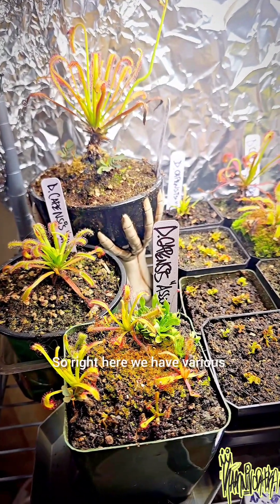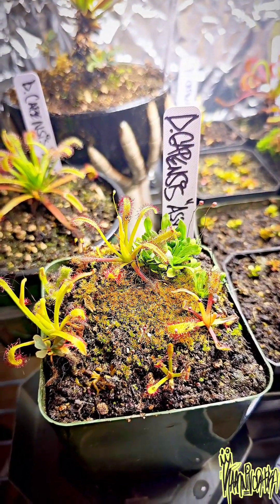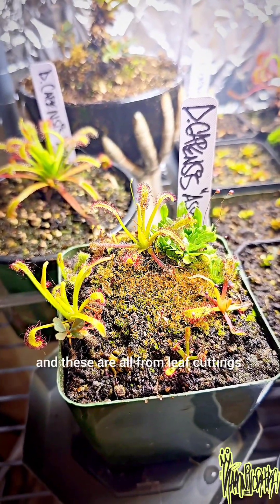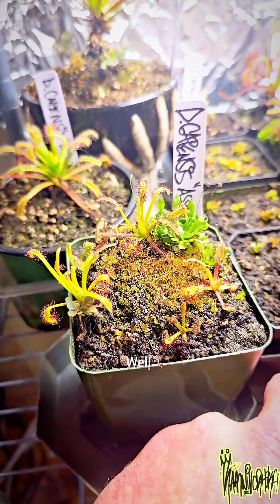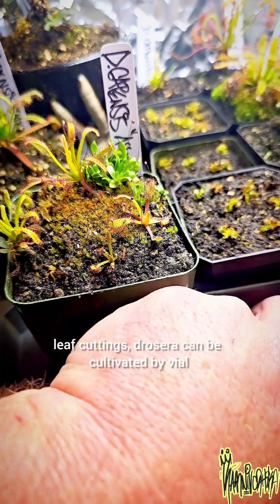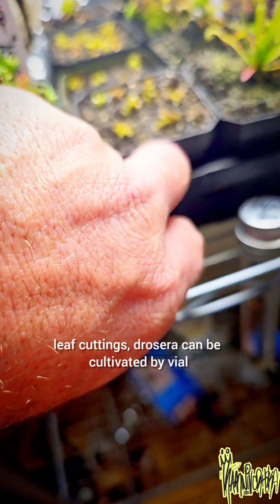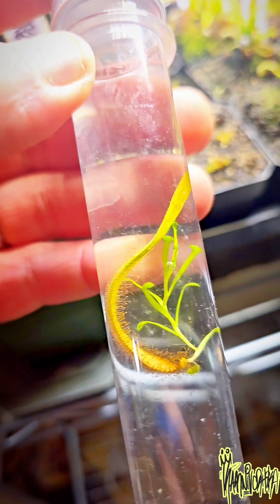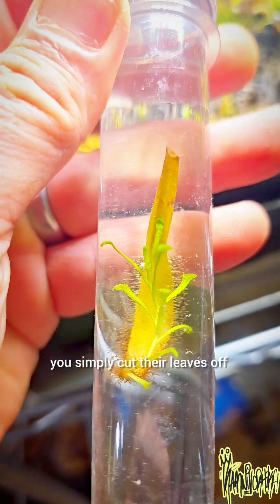Right here we have various Drosera capensis, and these are all from leaf cuttings. Drosera can be cultivated by vial and water — you simply cut their leaves off.